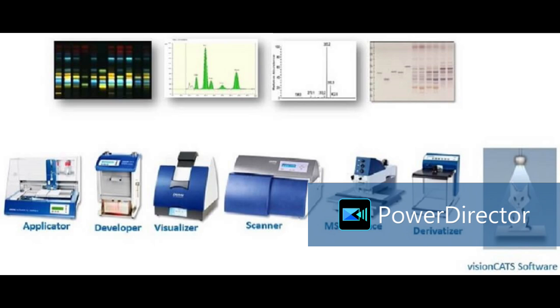Now talking about HPTLC, what does its P stand for? It always stands for performance: high performance thin layer chromatography. P does not stand for pressure at all. There is no role of any pressure involved in the HPTLC system. It is not high pressure thin layer chromatography. It is always high performance thin layer chromatography.